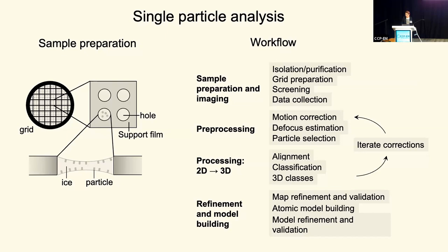You still have to come up with a project that isn't just something somebody else has already done, because it's always easier to do something when you know the answer. If you want to do something new, that's hard. That's the big step. And getting a good sample to do it with is the next big step. Once you've got good grids, sometimes you just fly through all this stuff and get really nice results. But the primary steps are still there.